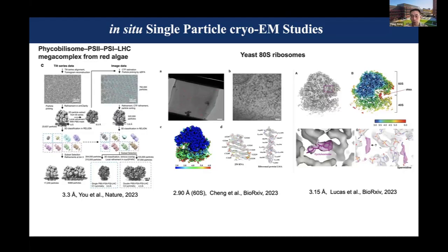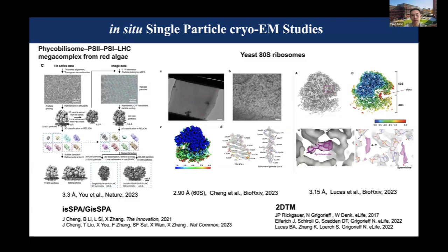They already got quite nice results, sub-3 angstrom resolution, with large molecular complexes.